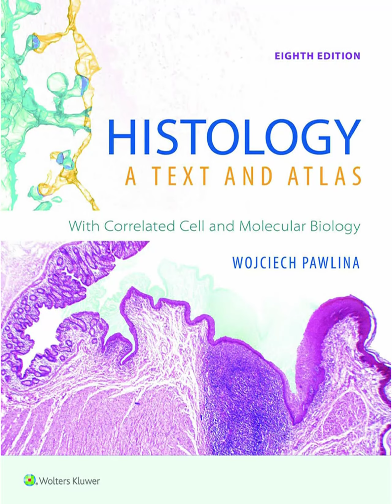So the most common microscope? That would be the bright field microscope. It's the standard you'll find everywhere. It's pretty straightforward conceptually: a light source at the bottom, a condenser lens to focus the light onto the specimen on the stage, the objective lens for primary magnification and resolution, and the ocular lens or eyepiece for final viewing. And staining is key here. Absolutely essential for bright field, because most unstained biological material is translucent and offers very little contrast. The stains provide that contrast, making things visible.